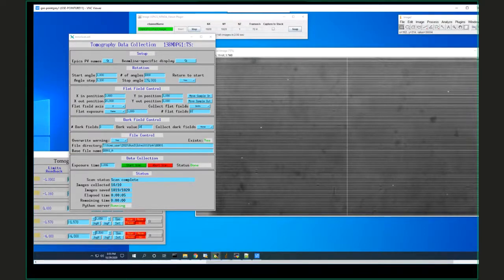There is a subtle problem that I haven't seen described in the literature, which is that it actually gets more sensitive as it's exposed to X-rays for a while. If I took a flat field where I covered half the image with the slits and the other half was seeing the beam, and it doesn't matter if it's monochromatic beam or white pink beam, then when I open up those slits, the place where the beam has been previously is brighter than where the slits were. And it takes, let's say, 10 minutes for it to get to a uniform sensitivity.